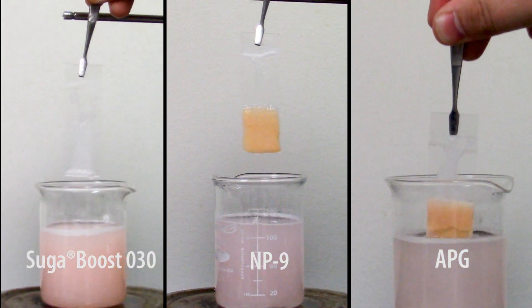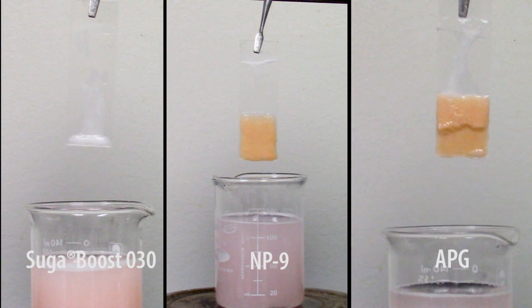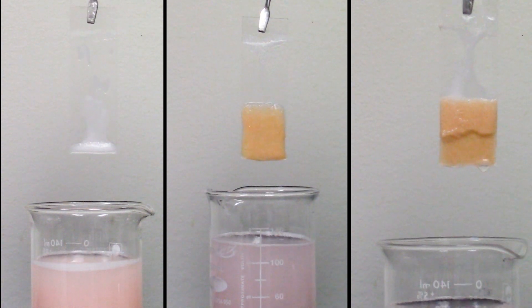Here you can see the slides coming out after 20 minutes of elapsed time. Again, SugarBoost is on the left, and NP9 and APG are on the right. You can see a pretty clear difference here.